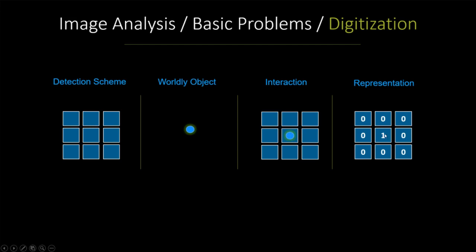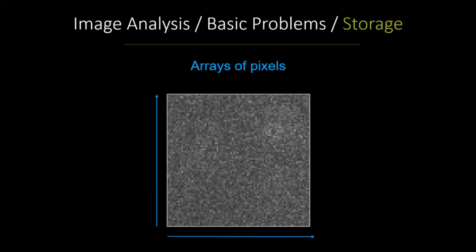And now we can represent this event in the computer. So now we can digitize what we're seeing in the world. And this is very, very powerful and very, very special. So now we're able to store and hold on to the data, apply powerful mathematical tools to the data, come back to the data at a later time, and ponder it at our convenience. But we have a problem. We represent this event as ones and zeros inside of a machine, and because our imaging instrumentation is getting better and better, now we're able to collect more and more pixels. So now we collect arrays of pixels, very large arrays of pixels.